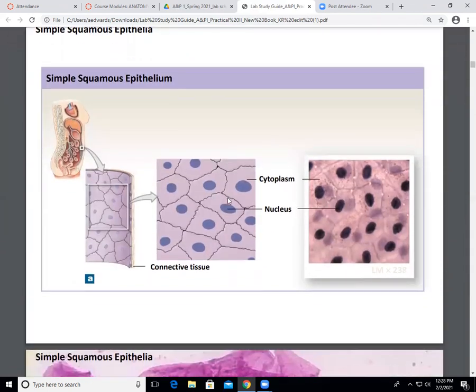It's another view. All right, so it doesn't all look exactly the same as the last slide, but these are one layer really, because it depends on what layer you look at it. Because if you look at the cell, it looks like this. If you look at it from the side, it might look like this, but if you look at it on top, it might actually look wider, right? Depends on where you're looking at it from. Okay, but these don't have a regular pattern. Okay, these are not cuboidal, okay? They're very irregular shaped.